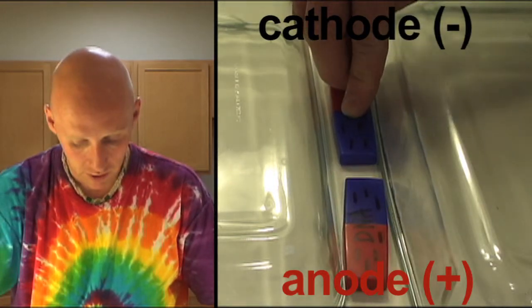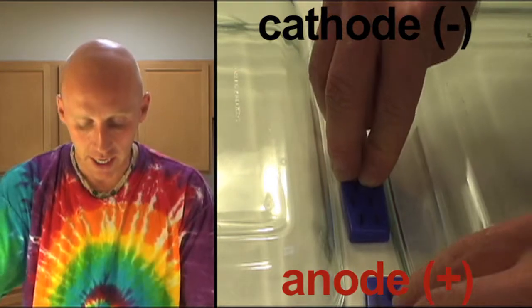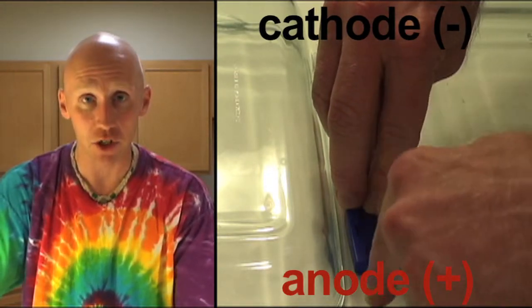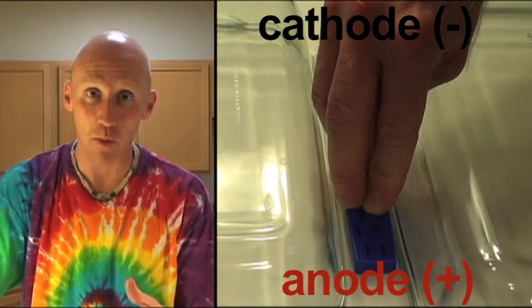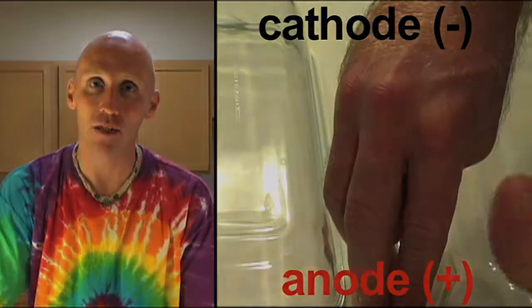So we would turn on the gel, and the DNA itself would proceed to move down through the pores as the gel actually runs. And it would literally be repelled, just like the magnetic field between these two magnets repel them, because I have the two poles facing each other. Essentially, we could say it's a negative pole and a negative pole repelling. DNA and the electric field itself works the same way. The electric field will repel the DNA away and make it run towards the positive electrode.